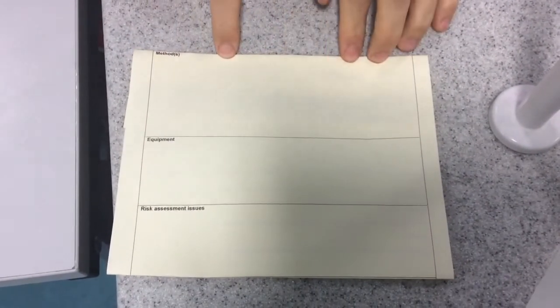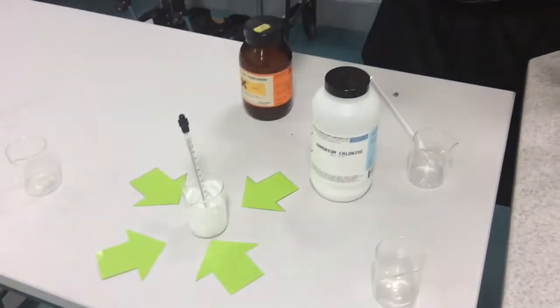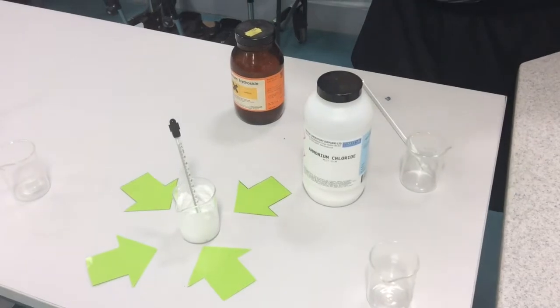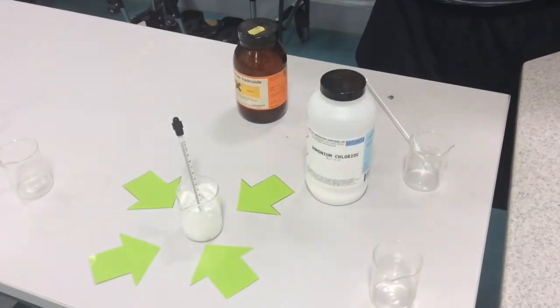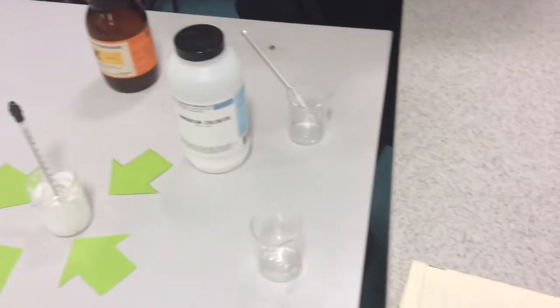I want the method—what are you going to do in your experiment? Now I want to design an ice pack, and I want it to be cold below zero for 10 minutes. How could I work out if an ice pack using these chemicals would be suitable?